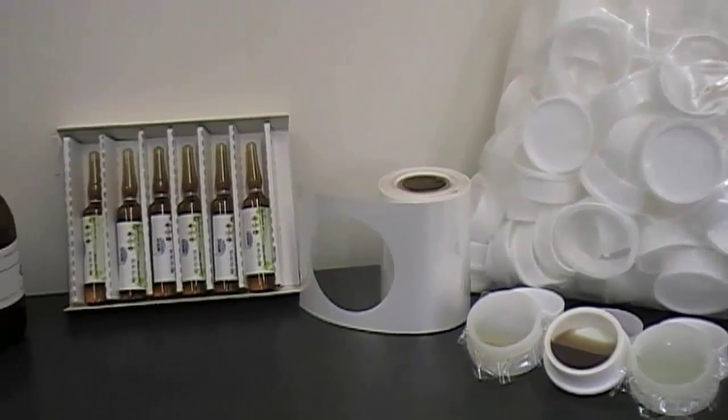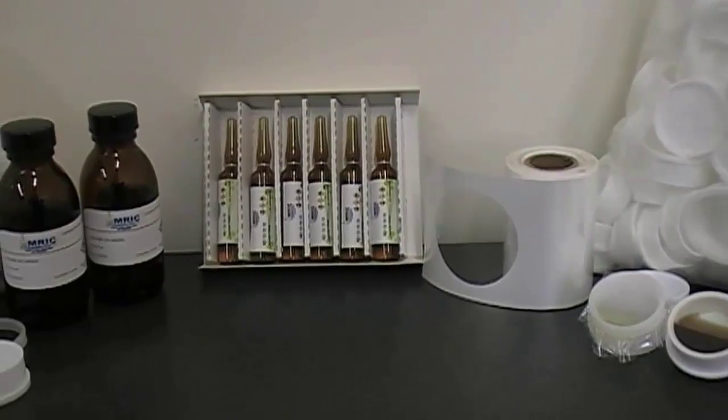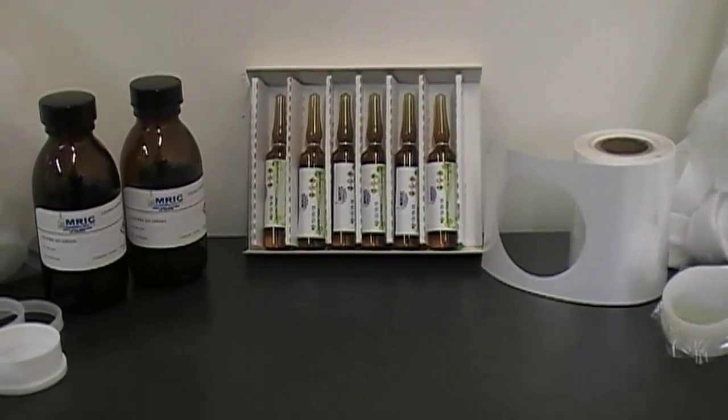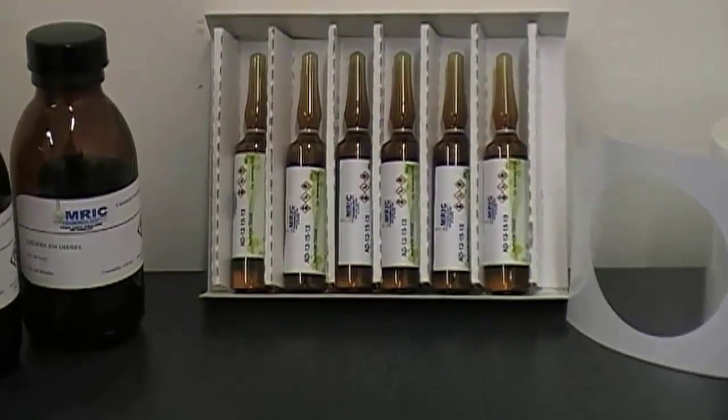We also handle vials of 10 and 20 milliliters which do not generate waste on low and high concentrations.